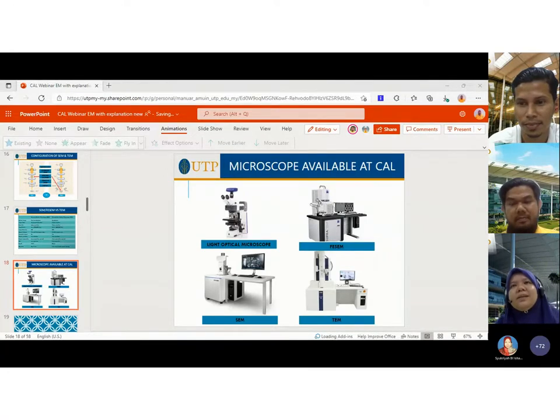From what I see from the paper, they reported the highest kV for FESEM, the highest kV, brand and model, that's it. But of course, when you publish the image, it needs to come with the scale bar, and that is a common requirement. But for the equipment details, you need to provide the highest kV, and also the brand and the model. I think for most papers that I see, that is enough already.